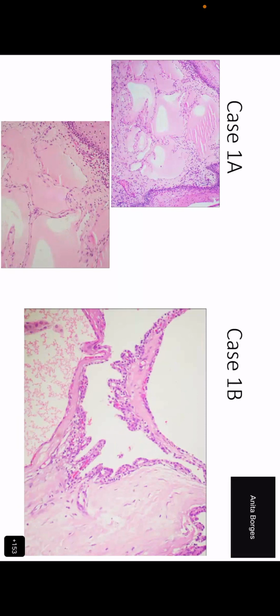All right. So according to Suveta, both 1A and 1B are epithelium. What does Vimy think? Ma'am, the case 1A is having flat endothelial lining, not the epithelium. And the case 1B is having low cuboidal epithelial lining.